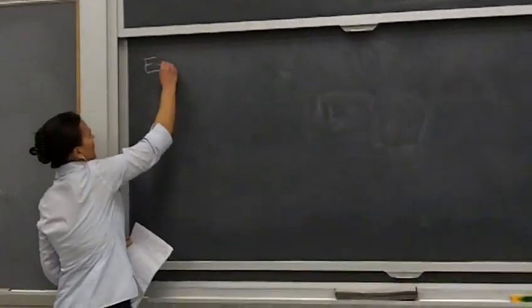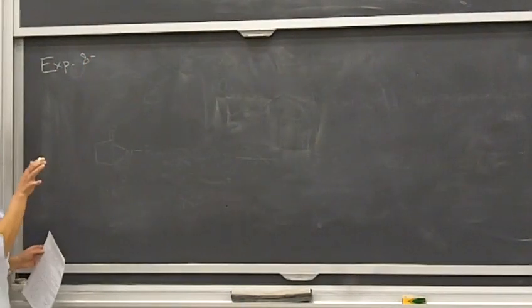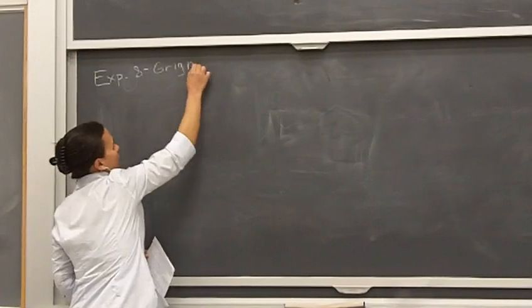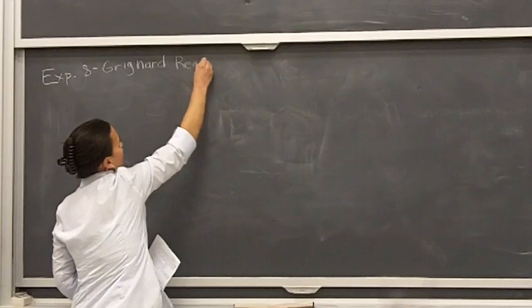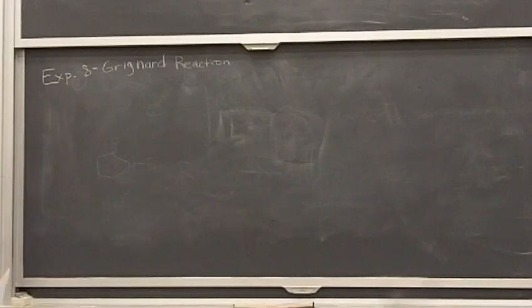All right, experiment 8. We are going to be doing an experiment that not a lot of sophomore organic lab classes would do, and definitely not a lot of sophomore organic lab classes in the middle of the first semester, okay? So this is pretty good experience that you are getting with this reaction.